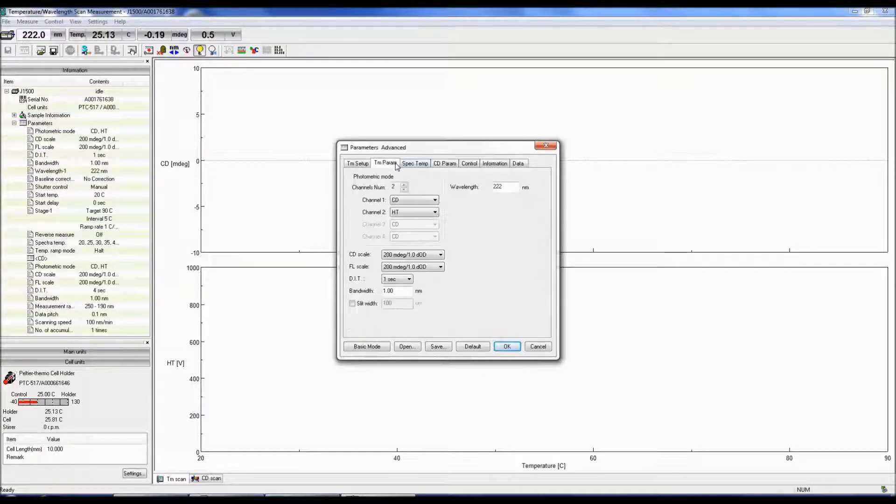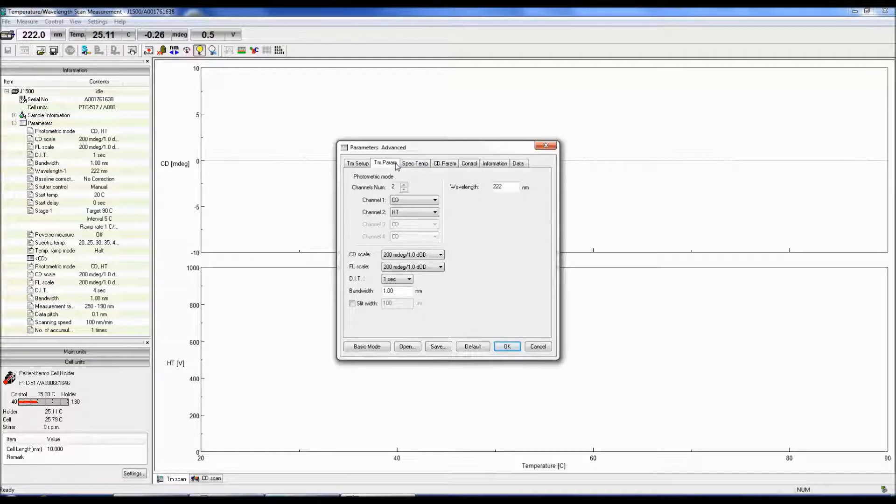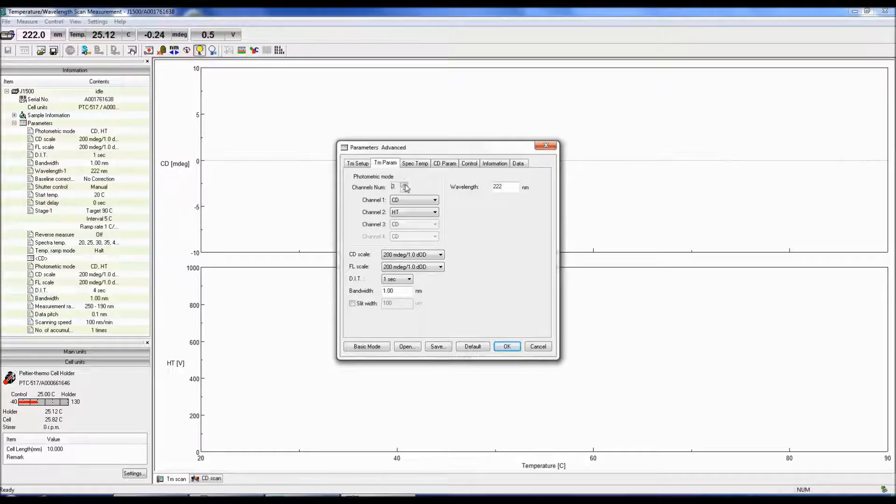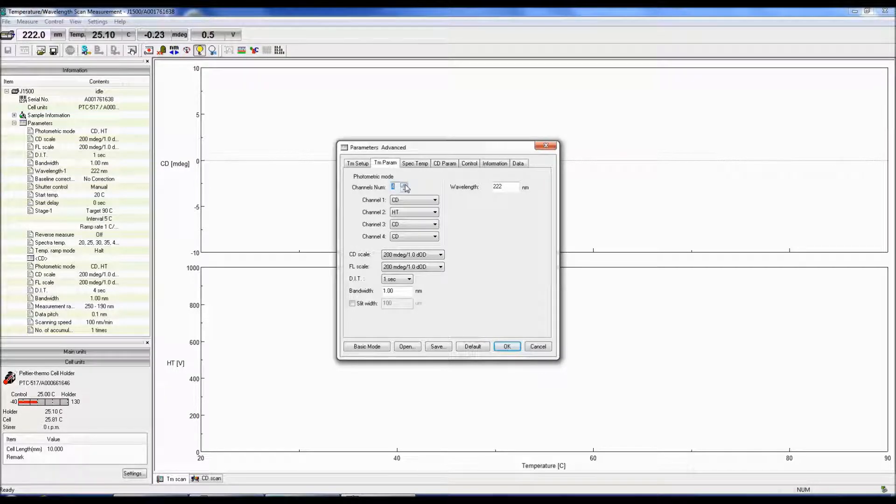The TM Parameters tab allows you to specify how many photometric modes will be measured, along with their settings. You can select up to four channels where the data will be acquired simultaneously.